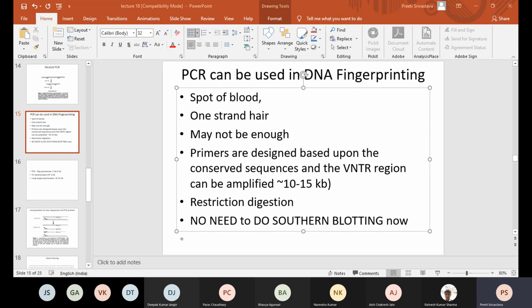So it's easy to remember: whenever it's polyacrylamide gel electrophoresis, it's going to be small oligos, maximum up to 500 base pairs, not more, right? When it is PFGE, pulse field gel electrophoresis, it is for larger genomes in megabases, right?